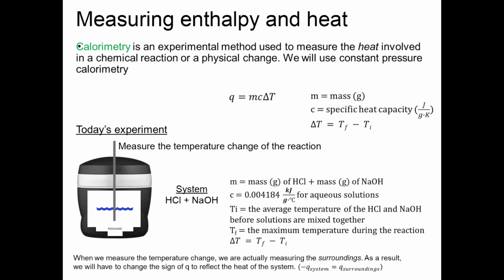So down below, this shows our calorimeter, which is what we're going to be using in our experiment. It has a thermometer stuck down through a hole into a chamber where we're going to combine HCl and NaOH. As you saw before, when you got the chance to see those two react, you know that it turns into a salt solution with water because it's an acid-base reaction. But it's exothermic, so some heat is going to be released, and we are recording that temperature change.